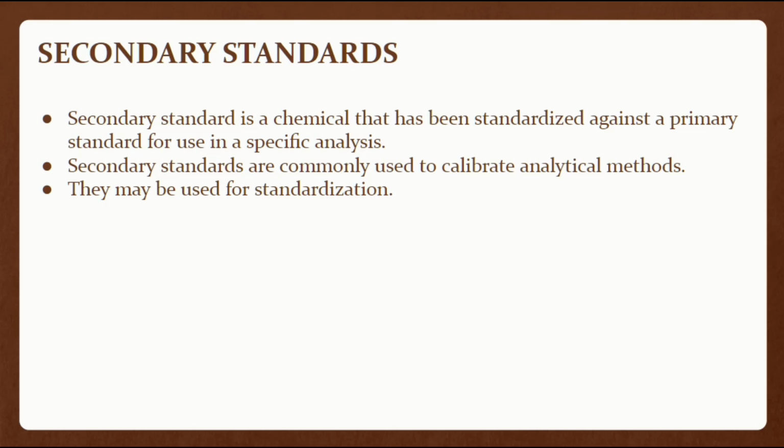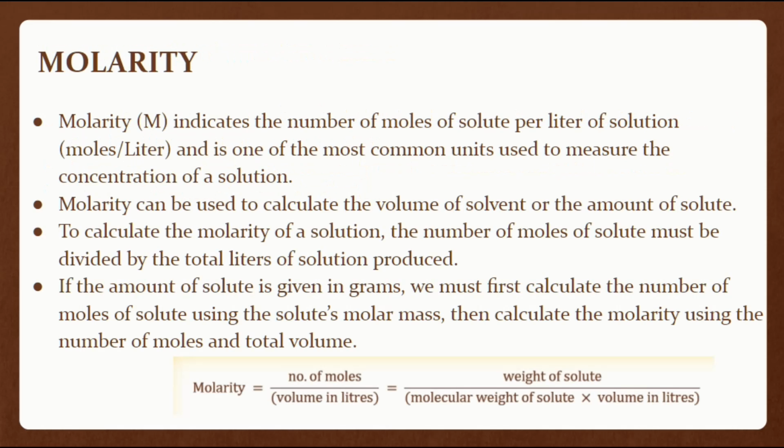Commercially available NaOH contains impurities of NaCl, Na2CO3 and Na2SO4 and readily absorbs H2O from the atmosphere. To determine the concentration of NaOH in a solution, it is titrated against a primary standard weak acid such as potassium hydrogen phthalate.